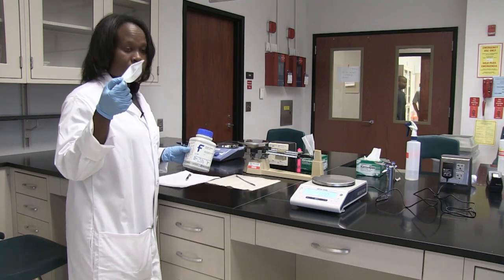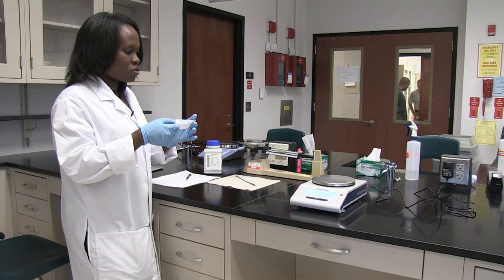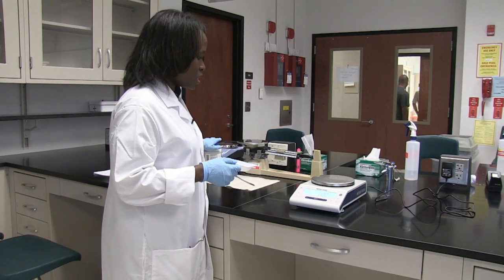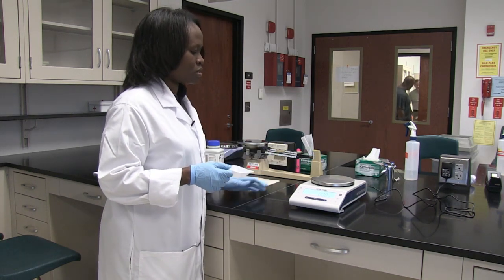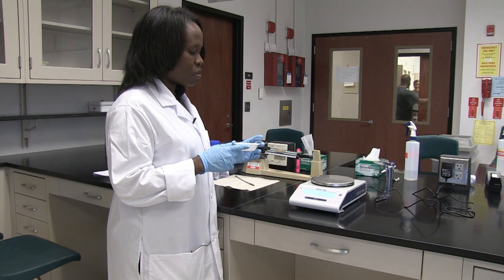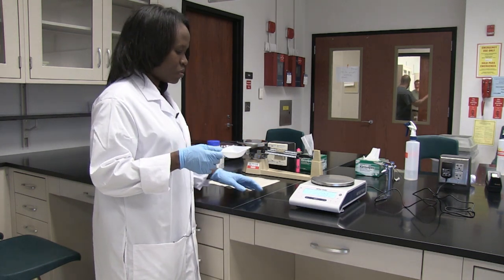I'm going to put this into this weighing boat. Remember, we do not add our chemicals or salts or powders directly to the balance. We put them in either a weighing boat or we use a weigh paper. Today I'm going to use a weigh boat.